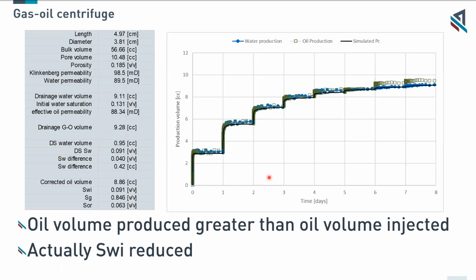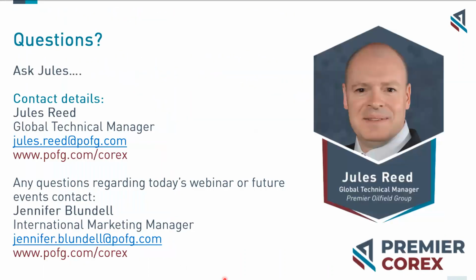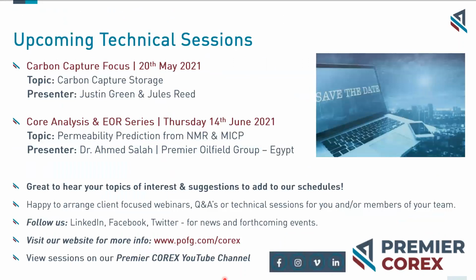There's one that says, have I seen the experiment called partly countercurrent? Is it different to countercurrent? Yes, partly countercurrent, depending on how you have your experiment set up, if you have, say, water coming across the surface of the plug, around the tube and across the surface at the top, then you could have both countercurrent and co-current happening at the same time. At one end you'll have countercurrent, and at the other end you may have co-current. So it depends how you've set your experiment up.